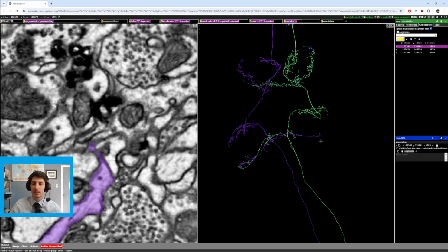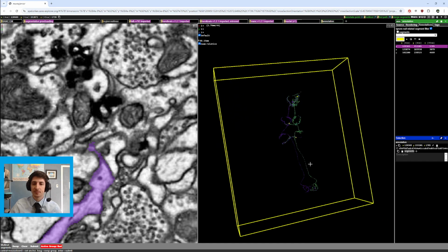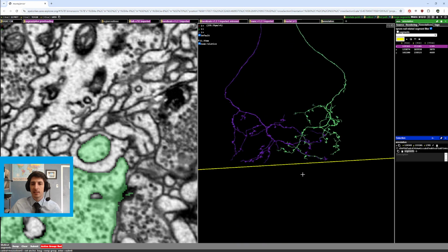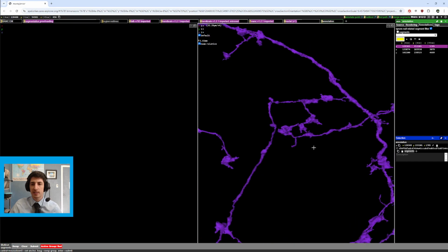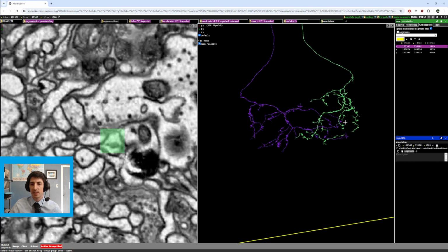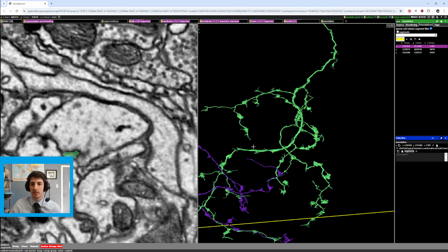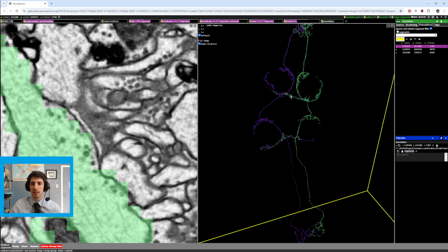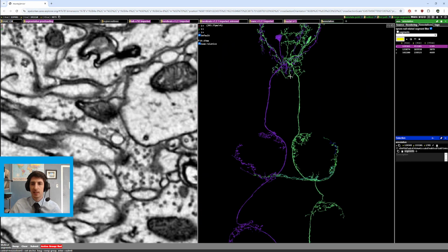So that's another indication. Okay, well, there's 2 branches on this side and only 1 branch on that side. What's the deal with that? You can scroll down here. This looks pretty good. You could probably grow out this tip and maybe that tip, but we know that we have generally most of the branches down here, and these are quite small. You could probably grow this out a little bit. So if you're feeling like you want to grow out some extra axonal boutons, please do.